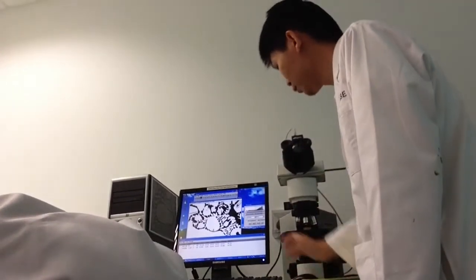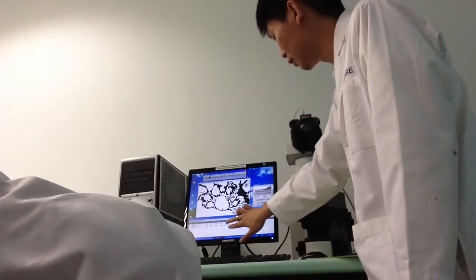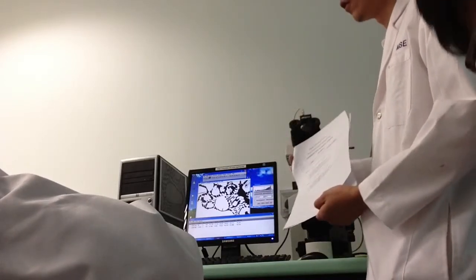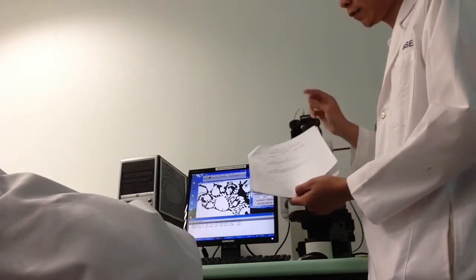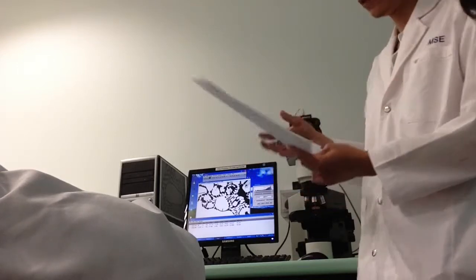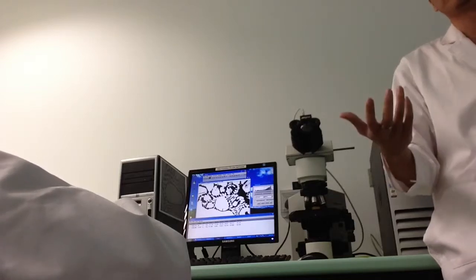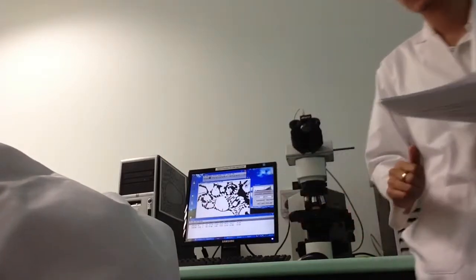Again, you have to print screen these two sets of values, which will help you to do your question 3 and question 4. So we have two screenshots for the calculation. For the calculation part, Wu-Fen will explain how to calculate the values using these two sets of values.